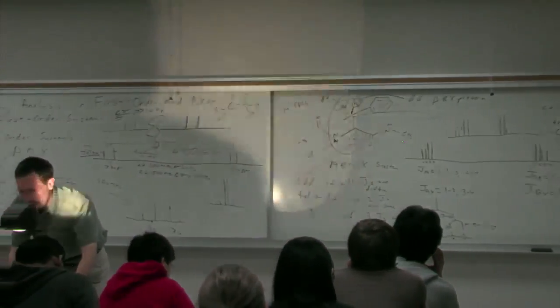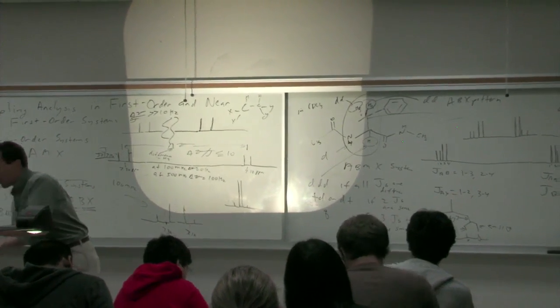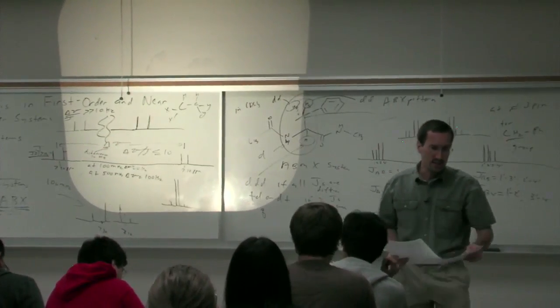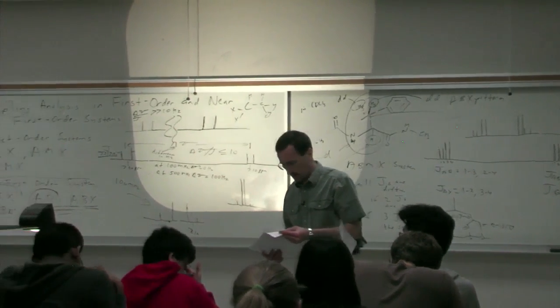You'll see exactly the same thing, but at least it'll be a nice chance for you to have a real spectrum. And I know I passed this out before, but we didn't look as deeply at this spectrum. Now let's look at it with a fresh pair of eyes. Let's look at it more deeply.